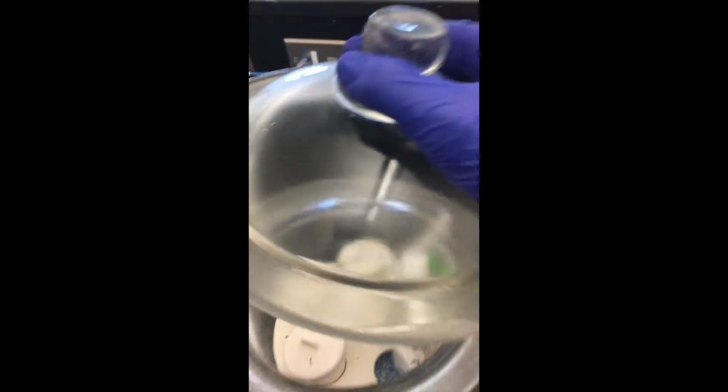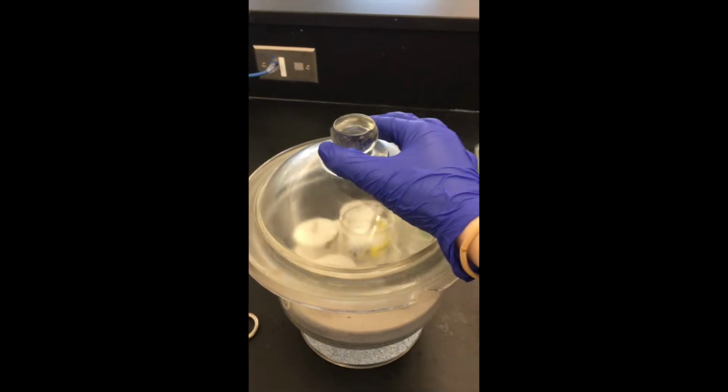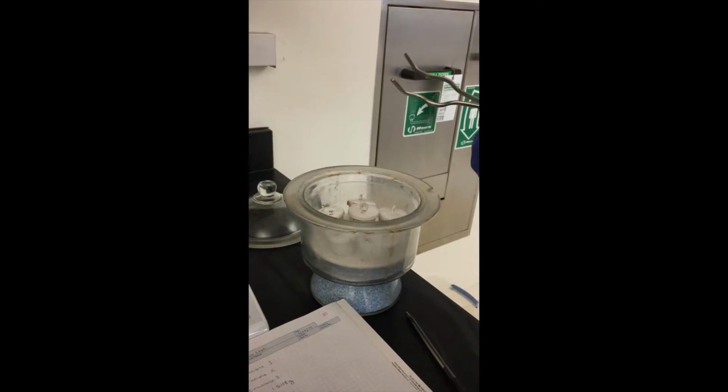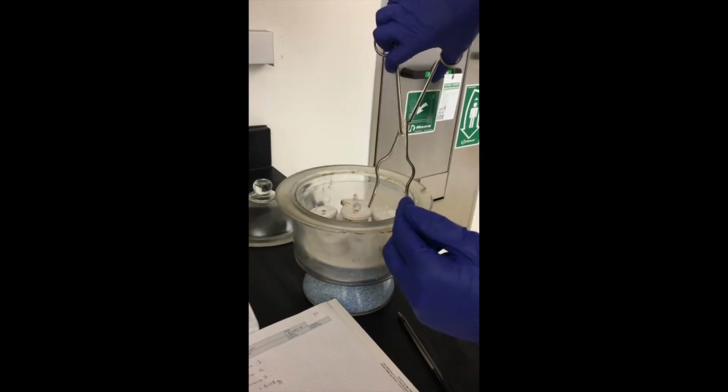and place them in your desiccator for about 10 minutes to cool. Then, using your crucible tongs, you're going to weigh each crucible one by one on the analytical balance.